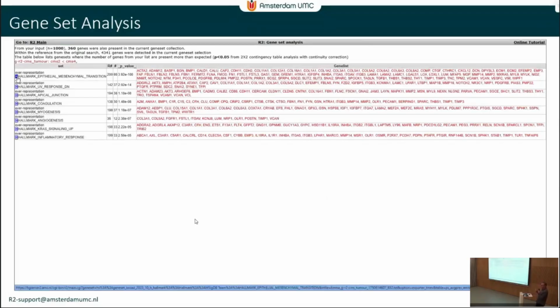Well, as you could already have seen in the volcano plot that I showed you a couple of minutes ago, it was really distorted towards the right-hand side, so most of the genes are upregulated in this particular example, which is a little bit unfortunate because here everything will have one color. If it's a bit more harmonized, you will also see that the genes popping up here as significant and interesting results can have a red color and a green color, or if you use multiple groups, another color, so that you can immediately see that there may be a confounder aspect on the signature that you're finding, and that you can then take into account when running the next step of the analysis.